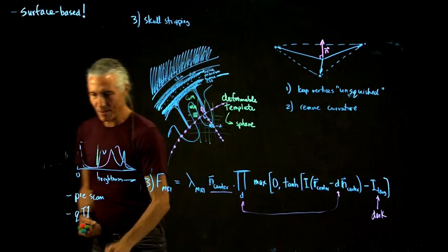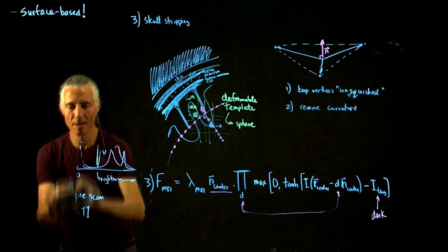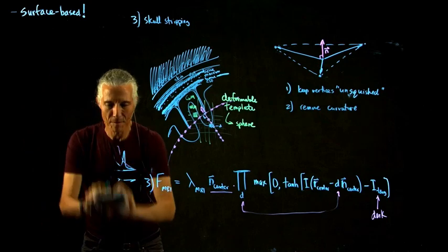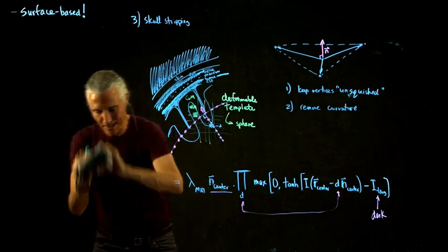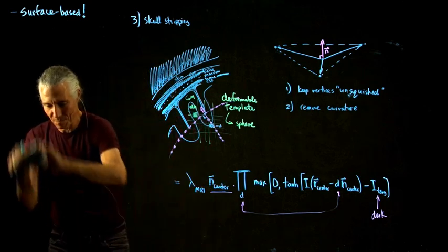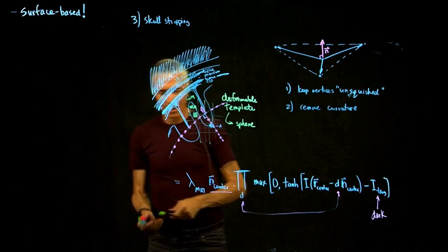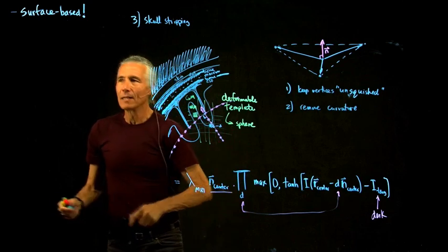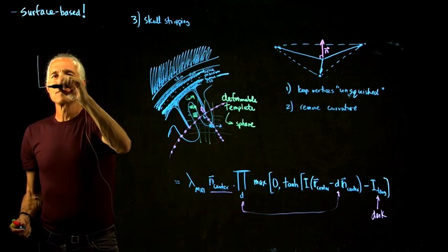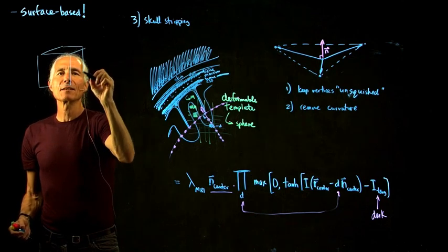Now, you might think, well, that's not such a big problem. We could just go and edit that one out. But the problem is there's 16 million voxels in a data set. And unless you're pretty much almost perfect, you're going to end up with a mess. So one method of dealing with that is to do an anisotropic filter.